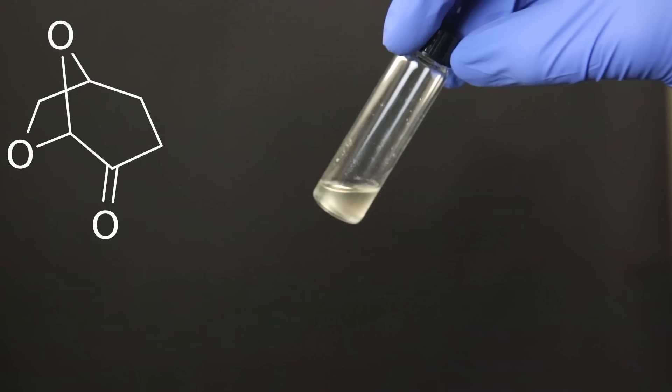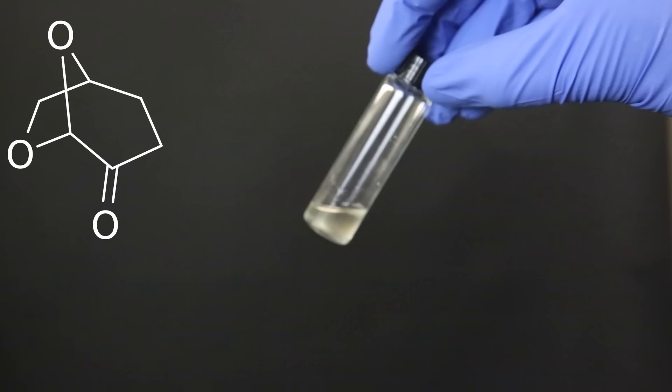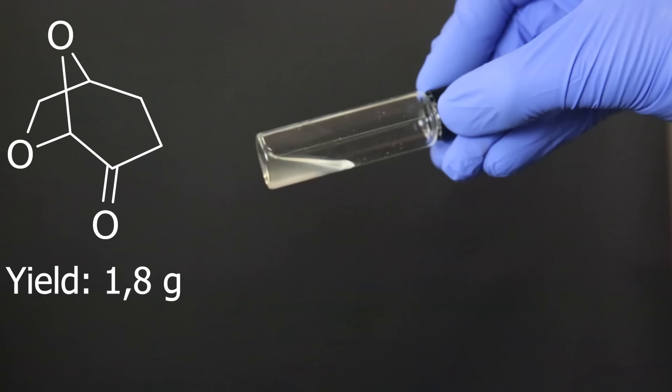But unfortunately, I have no way of testing its purity exactly. The cloudiness can also be from some water that was present in the ethyl acetate. Or perhaps some ethyl acetate itself. Anyhow, the yield of the product turned out to be 1.8 grams. Which is pretty much quantitative. Though its purity is unknown.